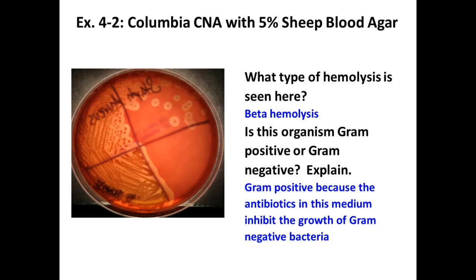So Staph aureus again, this is a special one. If you can kind of see the backwards handwriting there, right? This was a Staph aureus plate. So, Carolyn, does your blood agar plate look like that? Do you have beta hemolysis? Yeah. Hold it up to the light, see? Oh yeah.